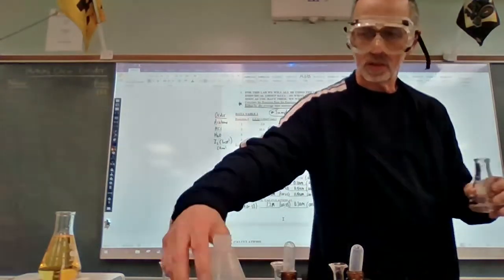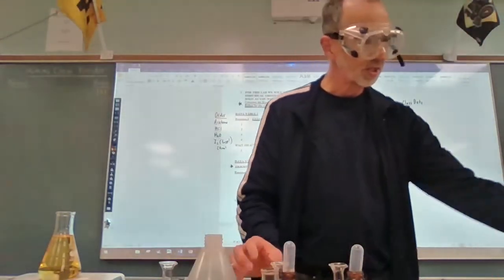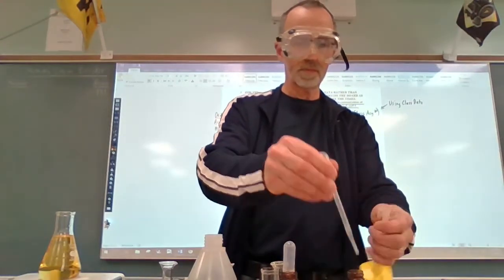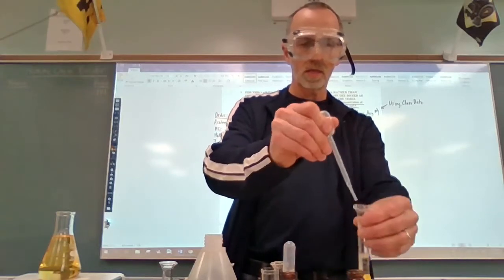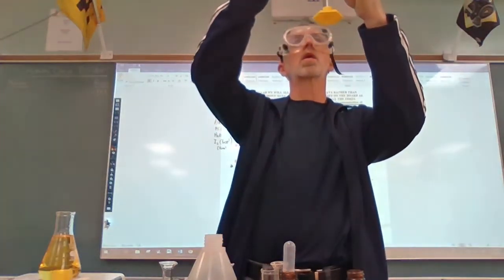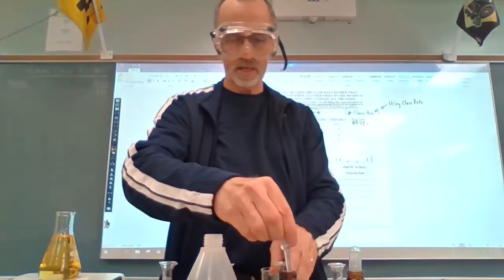Okay, I'm going to dump this out, rinse it out with distilled water, and now we will go on to reaction 2, where we're going to start with 10 mLs of acetone. Next, 5 mLs of HCl.